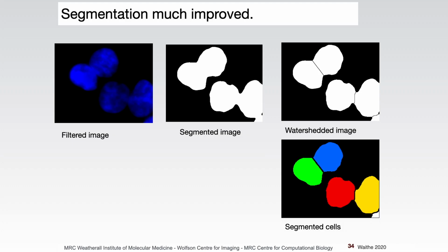Okay, so that's actually the end of the filtering section.